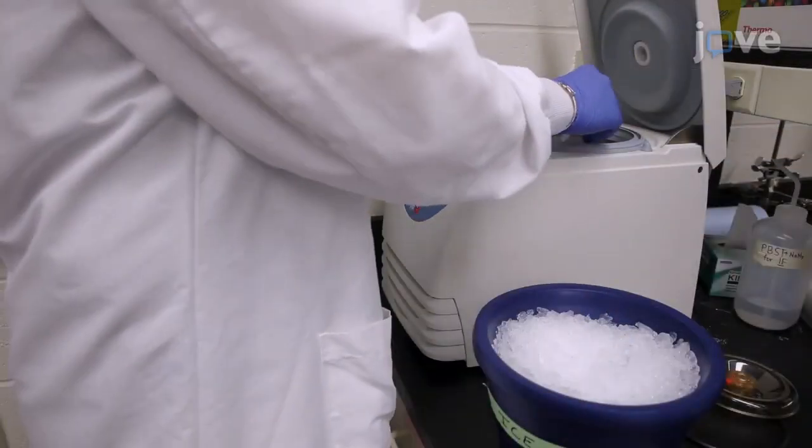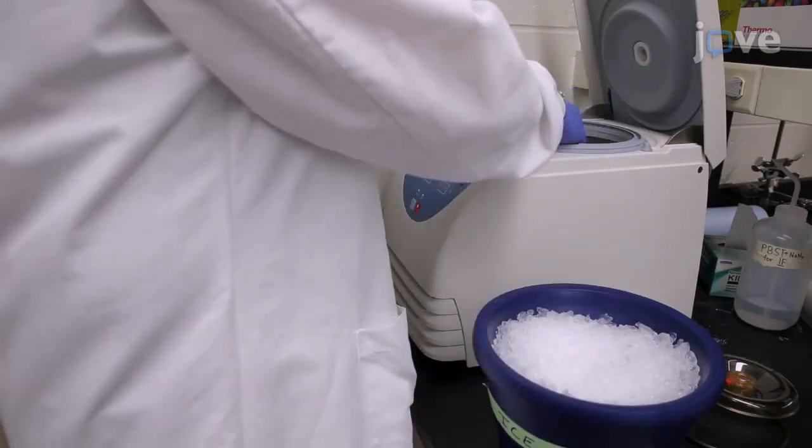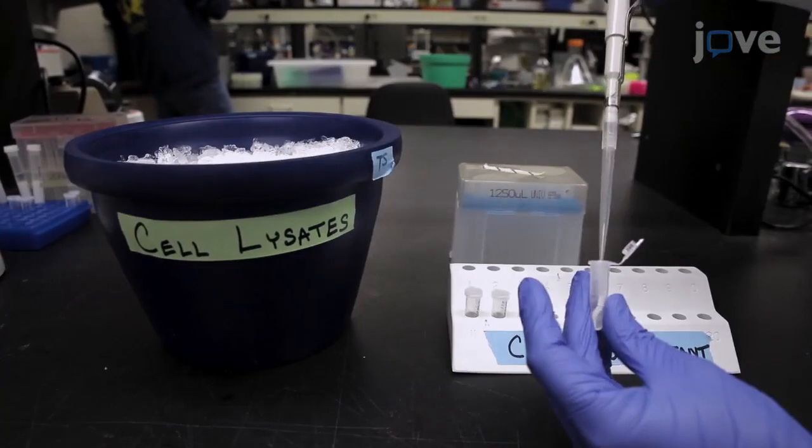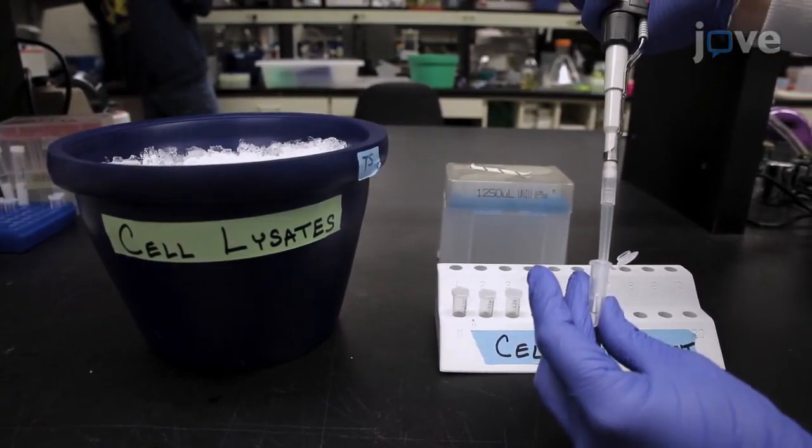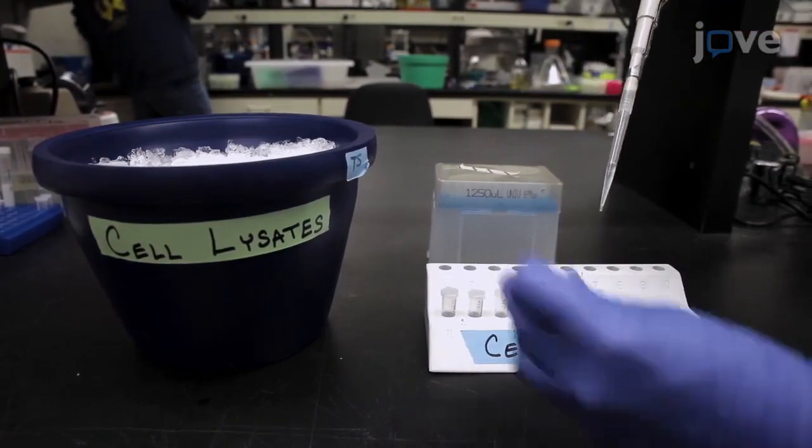Centrifuge at 17,500 times gravity at 4 degrees Celsius for 3 minutes. Then transfer 270 microliters of the supernatant to each of three new 1.7 milliliter microcentrifuge tubes.